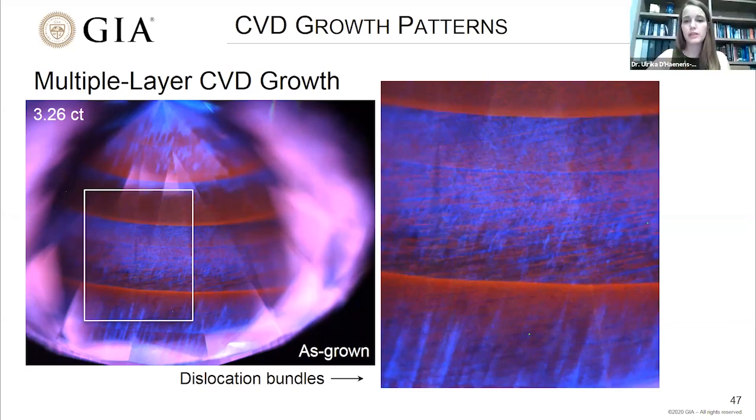Yes, so for some of the examples that I showed today, for instance, the one that's up right now, you would immediately be able to tell that this is a CVD diamond. We're looking for these layers and these striations combined with the colors we're observing that would be extremely rare in nature. That would allow us to identify these conclusively as CVD. In fact, amongst all the different testing techniques that we use, these patterns are finally the key thing that we use for the conclusion.